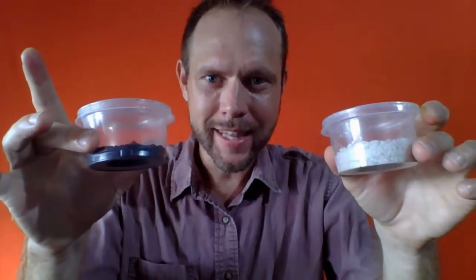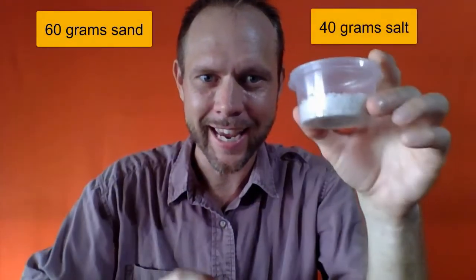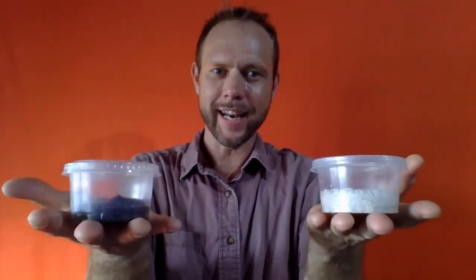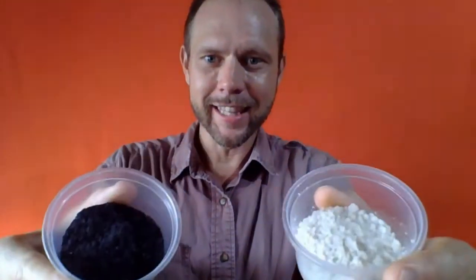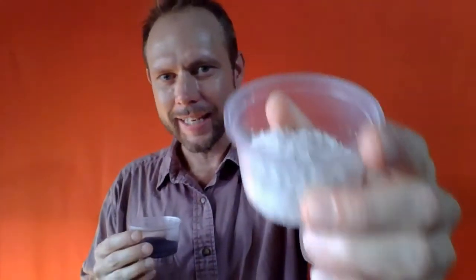And I've weighed them out. It turns out there was about 60 grams, exactly 60 grams, I should say, of the sand, 40 grams of the salt. And again, I've got salt, I've got sand. They're both pure, and I'm here taking the lids off. Again, you can take a look. White salt, black sand, 60 grams of pure sand, 40 grams of pure salt.